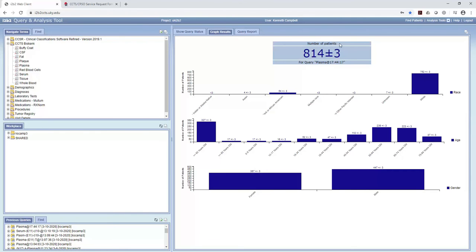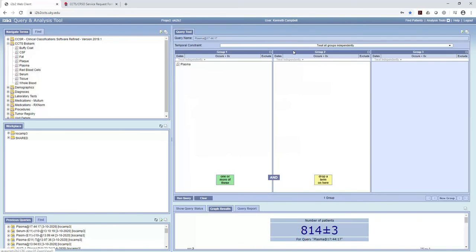Now nearly all of these numbers have a little plus or minus next to them. That plus or minus is just a bit of random noise put into the system so that you can't make a query that is so specific that you identify an individual patient. Okay, so that's how we find out how many people we have plasma from.